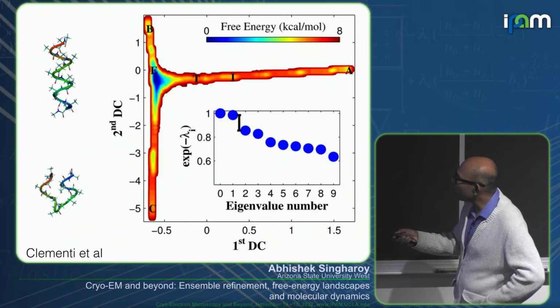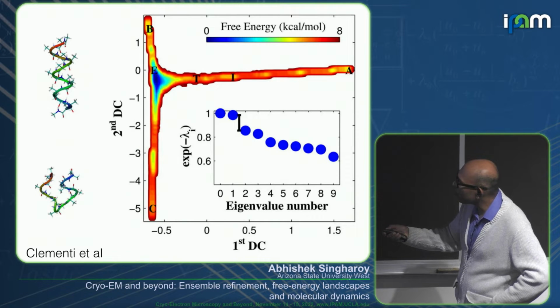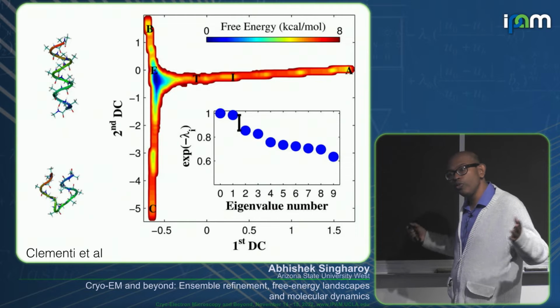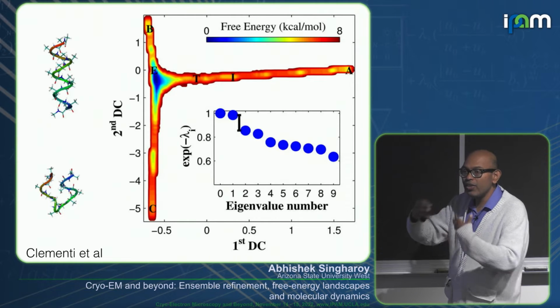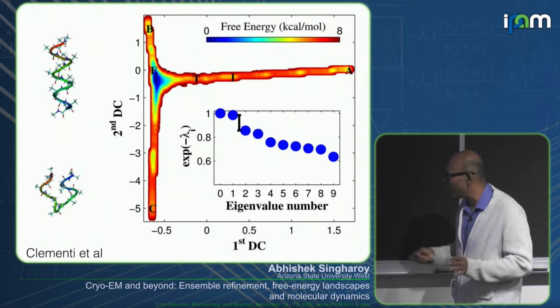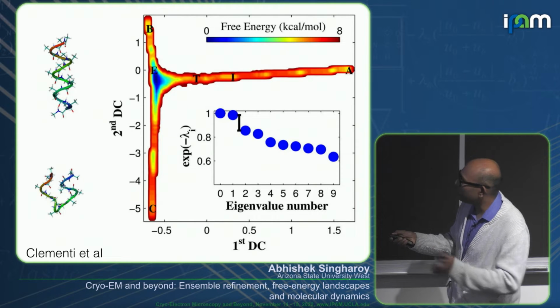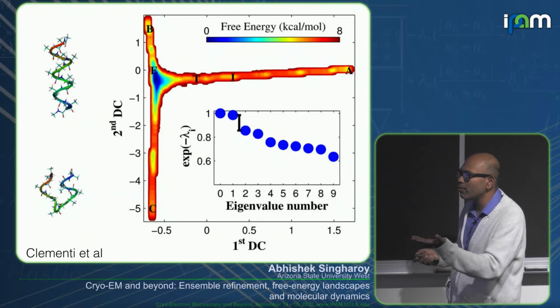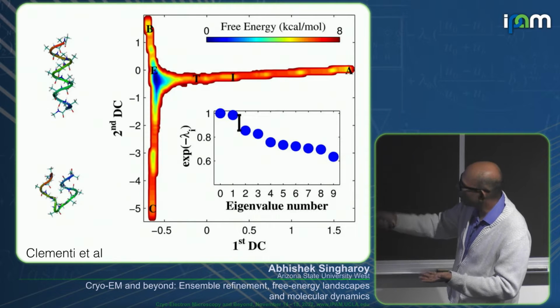Now, the biggest problem is that you're missing out information on so much dynamics in your system. You have used all of your data, so that problem is overcome. But the amount of reduced coordinates that you wanted to extract could have been more. No systematic test is done there. So you're just chopping it off here.